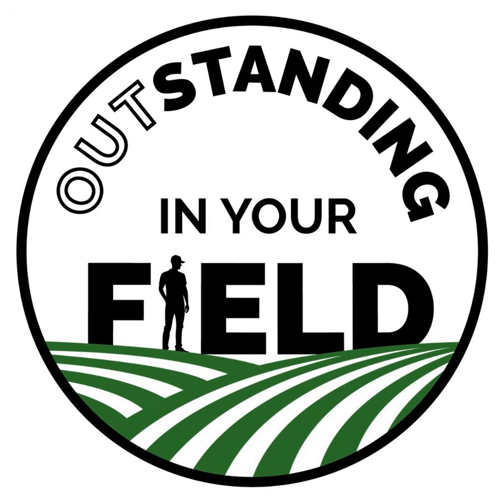We receive a sample, and when we say molecular markers, we have built specific markers that identify specific species of fungi and bacteria. Again, these are regions in the DNA of that fungi that are very specific to that species. And the beauty about these markers, similar to when you go to the emergency room, is that they're very easy to run, and you can run many of them in a very small amount of time so that you can get a result back really easily. So think about going to the emergency room and getting tested for a cold, and you get those results right away. That's the same process we do in the diagnostic lab.